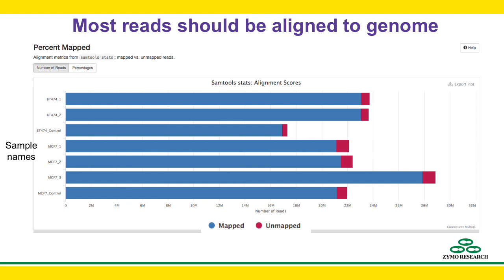Let's move on to the alignment step. In this plot, you can see how many reads were aligned or mapped to the reference genome — the blue bars — and how many reads were not — the red bars. Most of your reads should be aligned. If a large portion of your reads are not aligned to the reference genome, it indicates a problem with the experiment, such as foreign organism contamination.